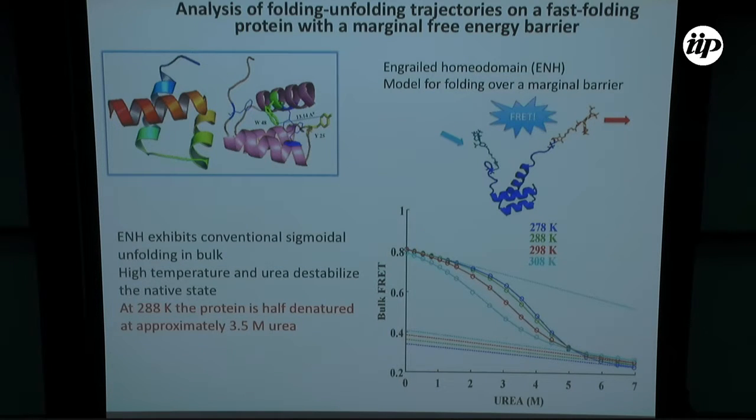So we try to minimize the contact with the structure. And then the other thing that we do is we check that this protein with the labels has the same thermodynamics for folding than the protein without labels. And if it does, it's a relatively good control that the perturbation is sufficiently small. But this is not always true. Sometimes you do this experiment and then you check, and your protein is behaving in very different ways. And most people that do these experiments don't check. Okay? And if they don't check, you don't really know.